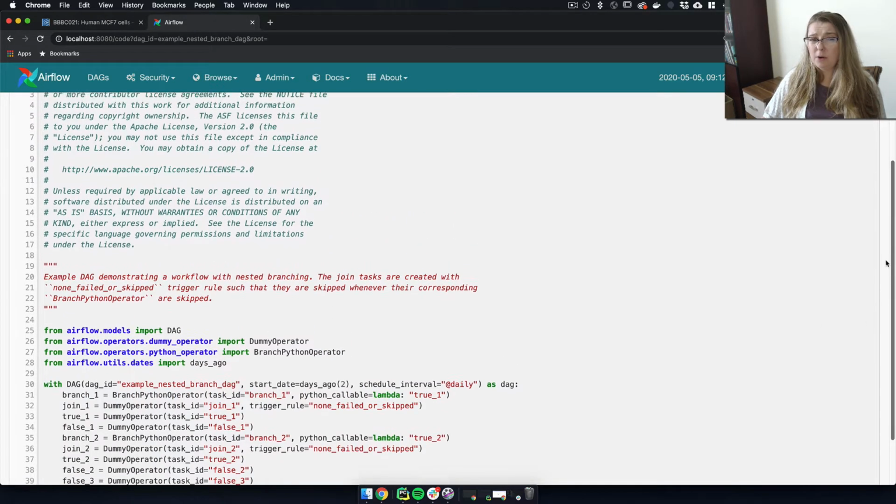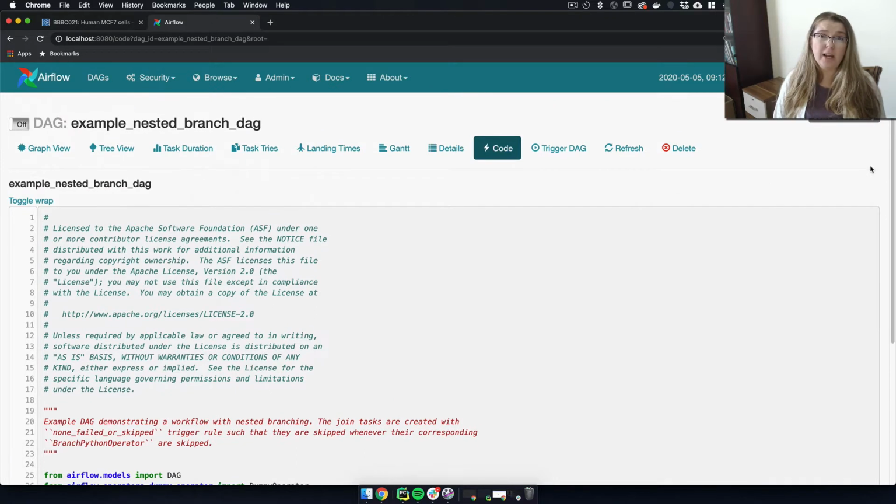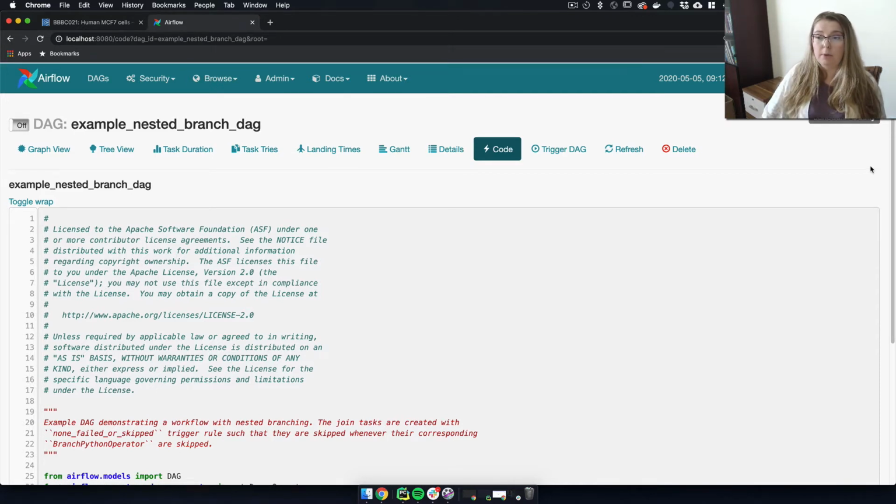And then because Airflow is very, very flexible, there are different ways that you can trigger these analyses. So you can trigger the analyses manually or using something that's outside of the system. So for instance, this setup that I discussed earlier where you have a LIMS system and the LIMS says, okay, imaging is done, and then you go and you trigger an analysis. You could do something on a cron job kind of schedule where you look for something daily.